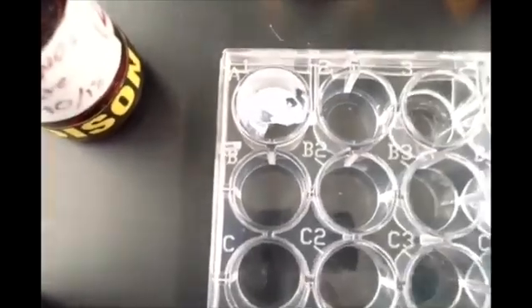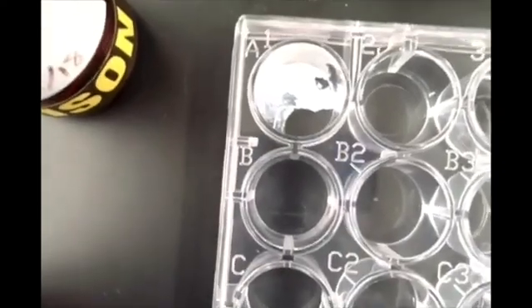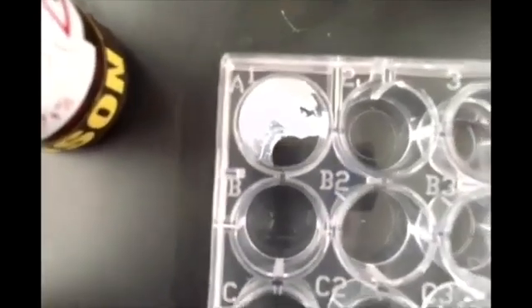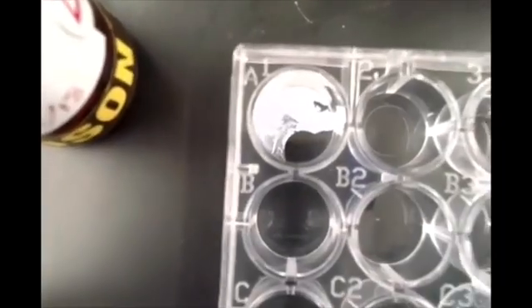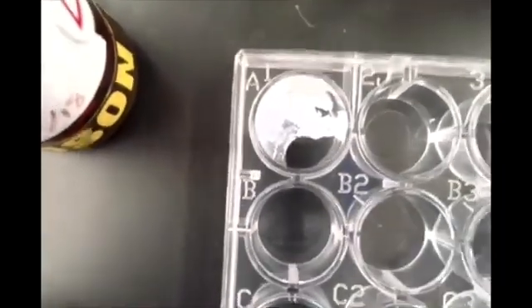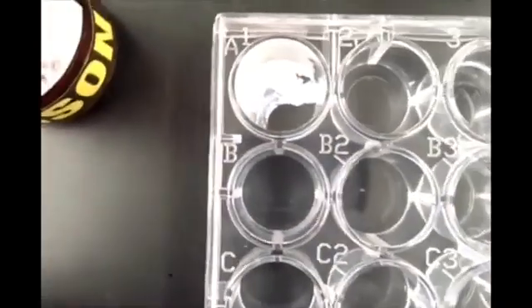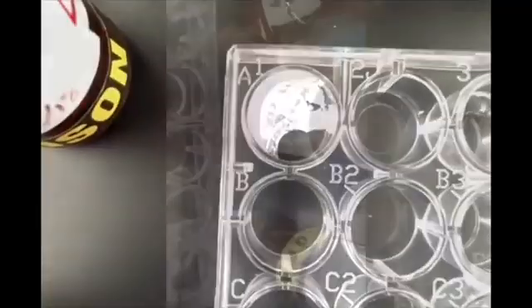Okay, and hopefully that should be pretty clear as to what happened there. You can see it's turned white and cloudy, so it's clear evidence of a white precipitate. This test should look pretty familiar to you if you remember, this is a test for chloride. Silver nitrate forms silver chloride with any chloride ions present. So your sodium chloride provides those chloride ions and forms that precipitate of silver chloride, which you can see.